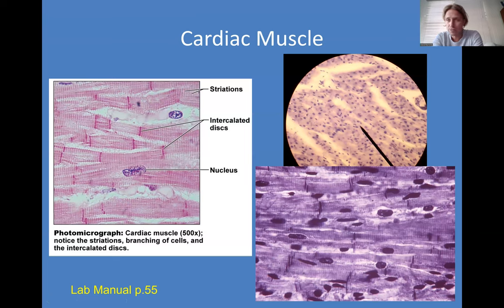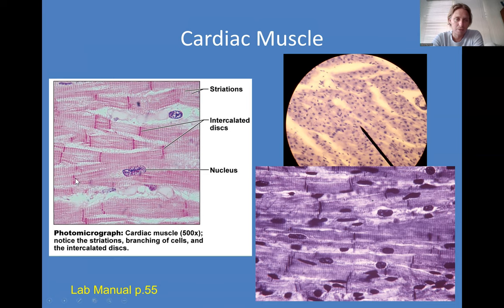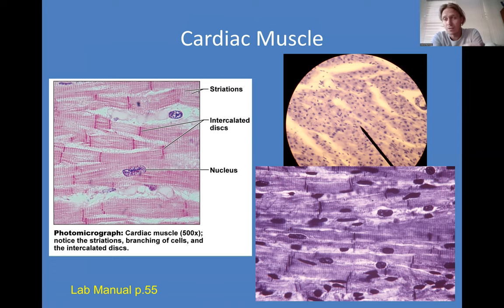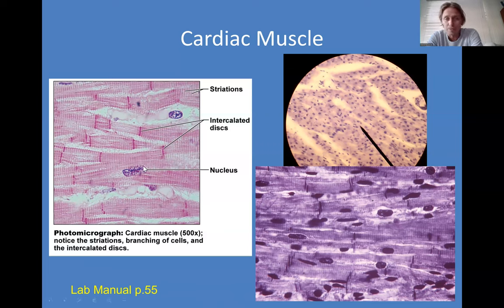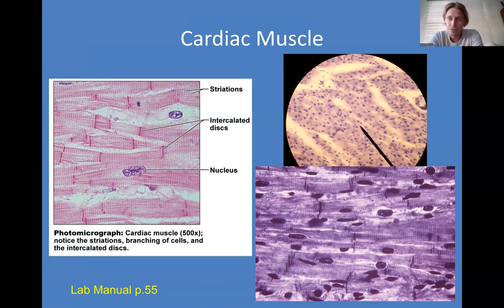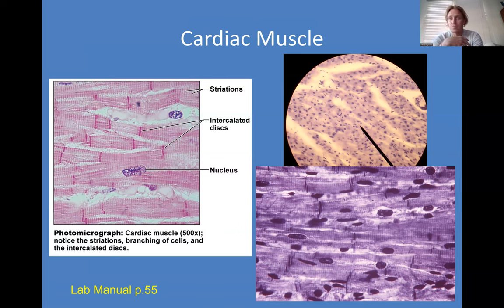The next type is cardiac muscle. It's very similar in some aspects to skeletal muscle, but also very different in others. Here is one cardiac muscle cell — it makes a finger-like or branching pattern with its plasma membrane. These cells are not nearly as long as skeletal muscle cells; they're short. Because they're short, they only have one nucleus — they're uninucleated like most other cells in your body. That nucleus is also not pushed off to the periphery; it's right in the middle of the cell. Both cardiac and skeletal muscle share striation.